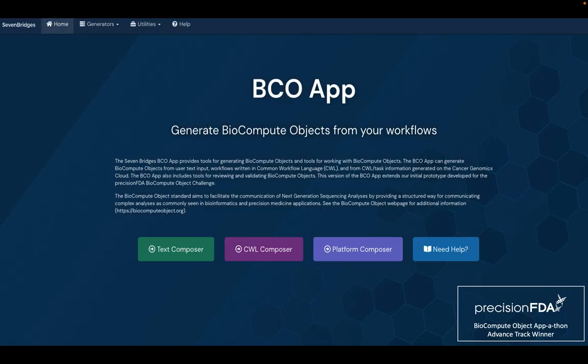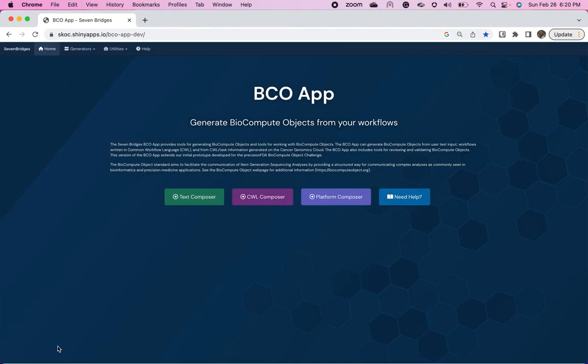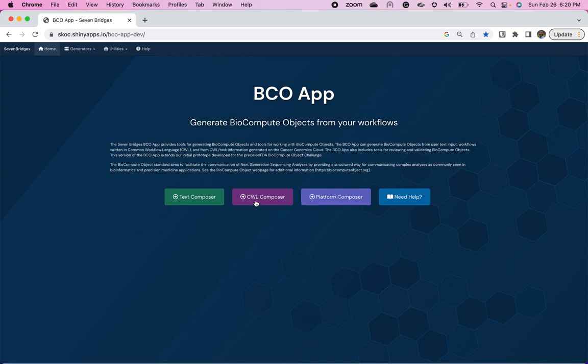And so now I'm actually going to walk you through a quick demo of the BCO app. So this is our BCO app. As you can see, we have a text composer, a CWL composer, and a platform composer. So I'm going to take you through the CWL composer.